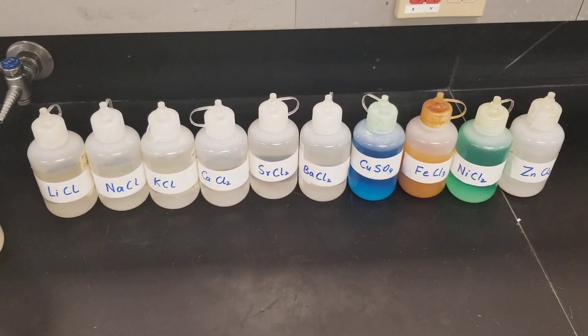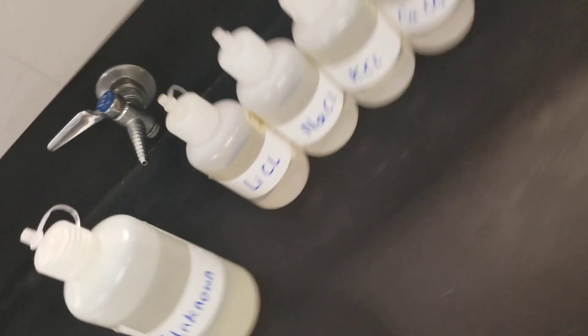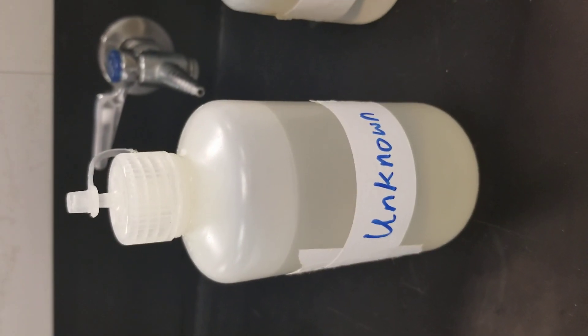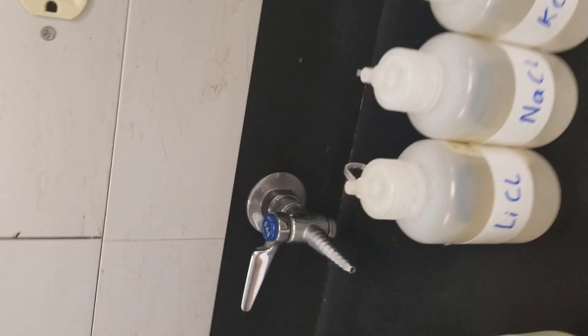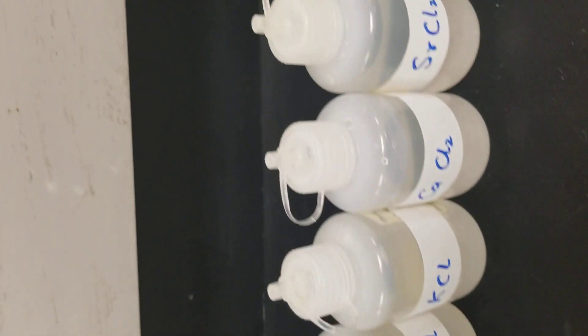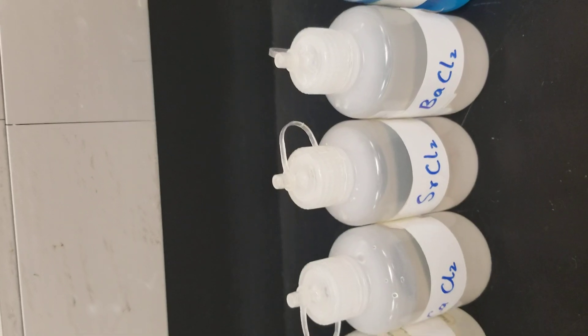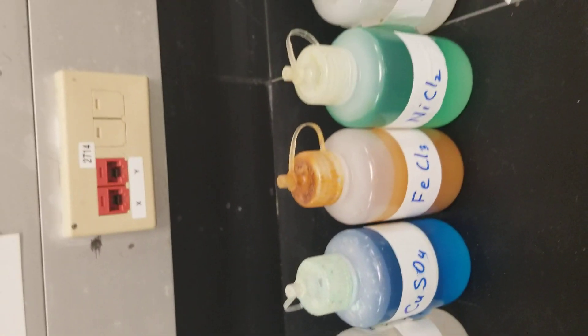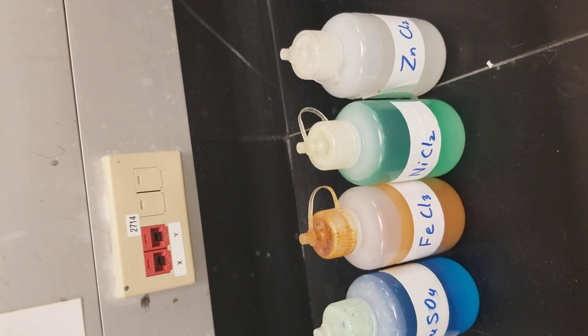For the lab, we have 10 different known metal halide solutions and one unknown metal halide solution. Out of these 10 solutions, the first three are Group 1 alkali metals, the second three are Group 2 alkaline earth metals, and the last four are transition metals.